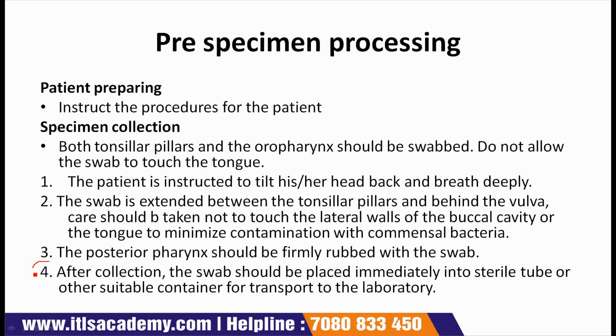Fourth point is: after collection, the swab should be placed immediately into a sterile tube or other suitable container for transport to the laboratory. These are 4 common steps for the specimen collection.